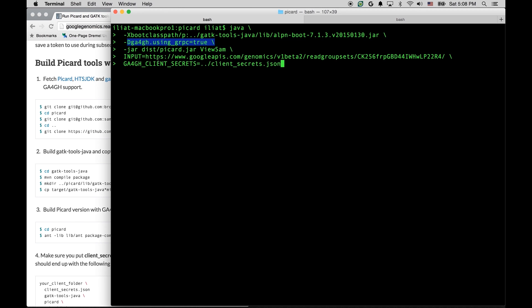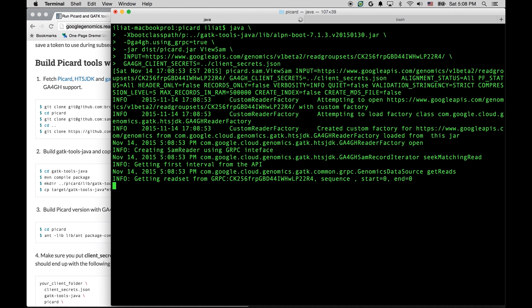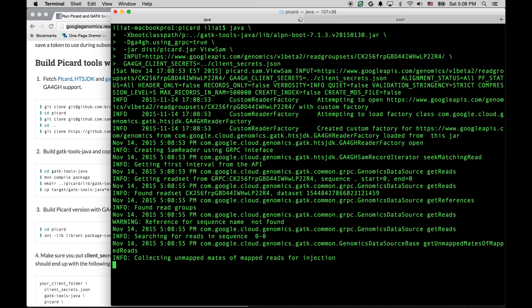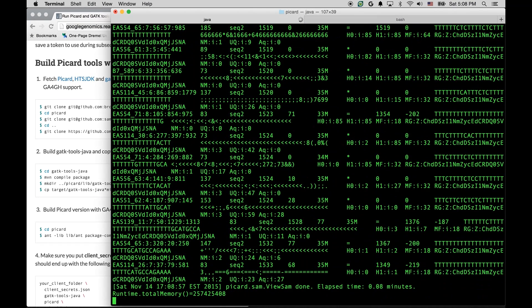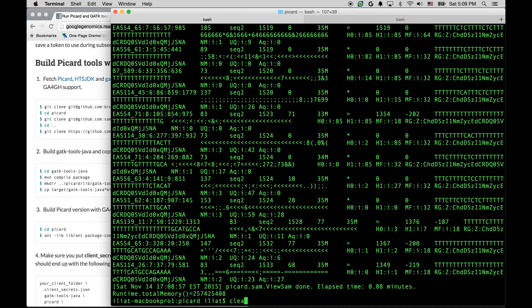Again, we are using URL as an input, and we are specifying the path to the secrets file. Let's run this. All right, so this worked as well.